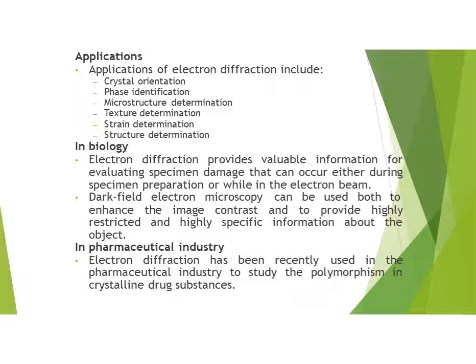Now it's time to discuss the applications of electron diffraction techniques. The applications include crystal orientation, phase identification, microstructure determination, texture determination, strain determination, and structure determination. In the biology field, the electron diffraction technique provides valuable information for evaluating specimen damage that can occur either during specimen preparation or while under the electron beam.